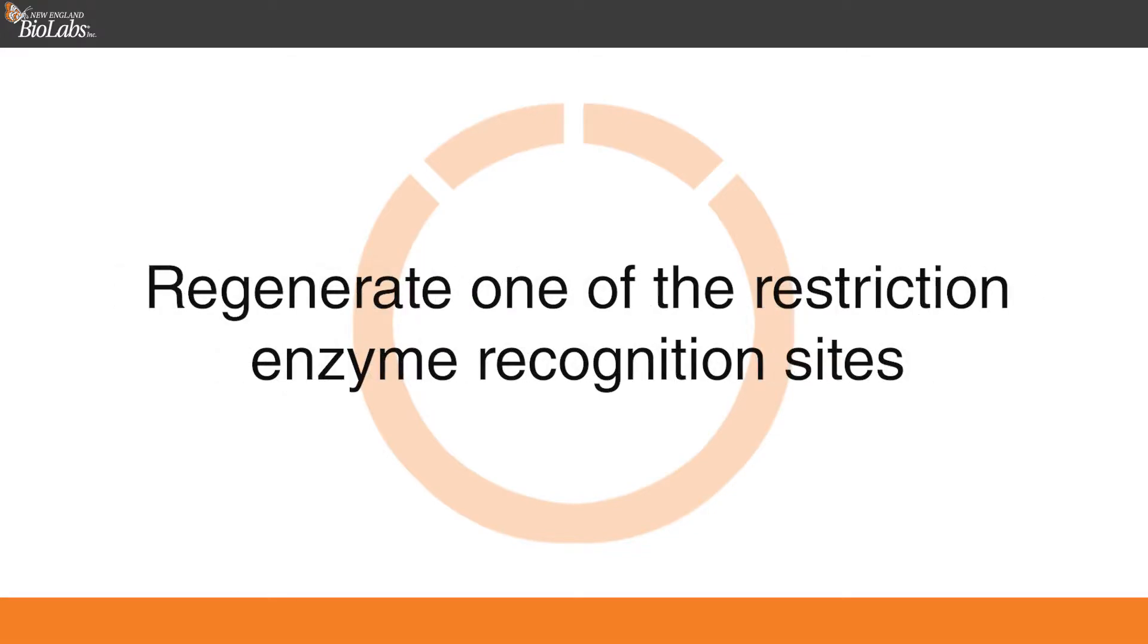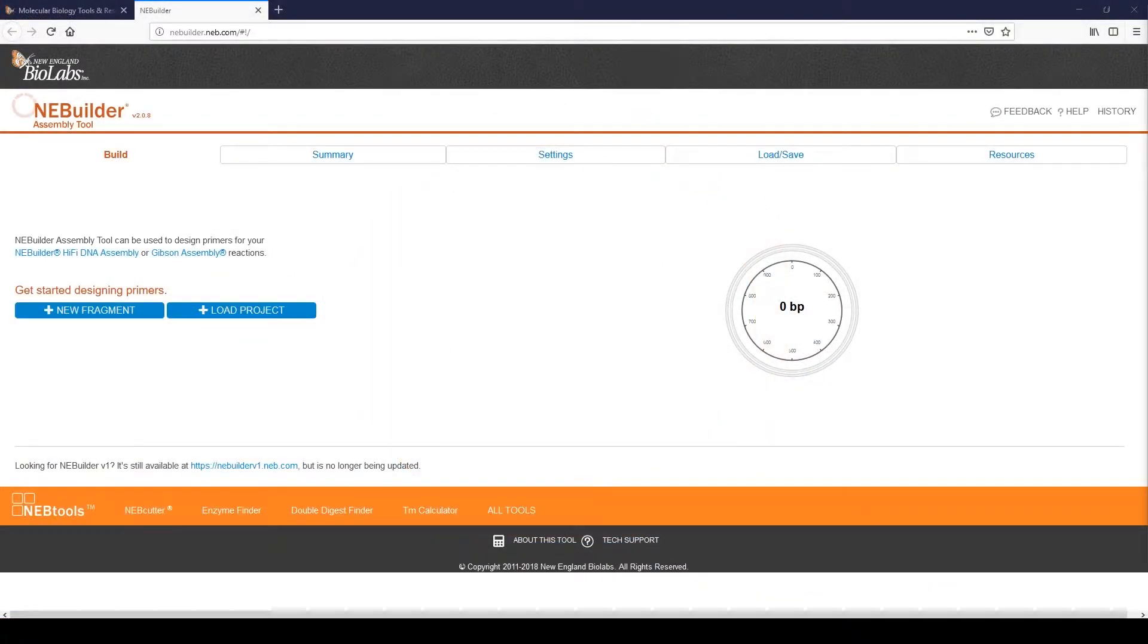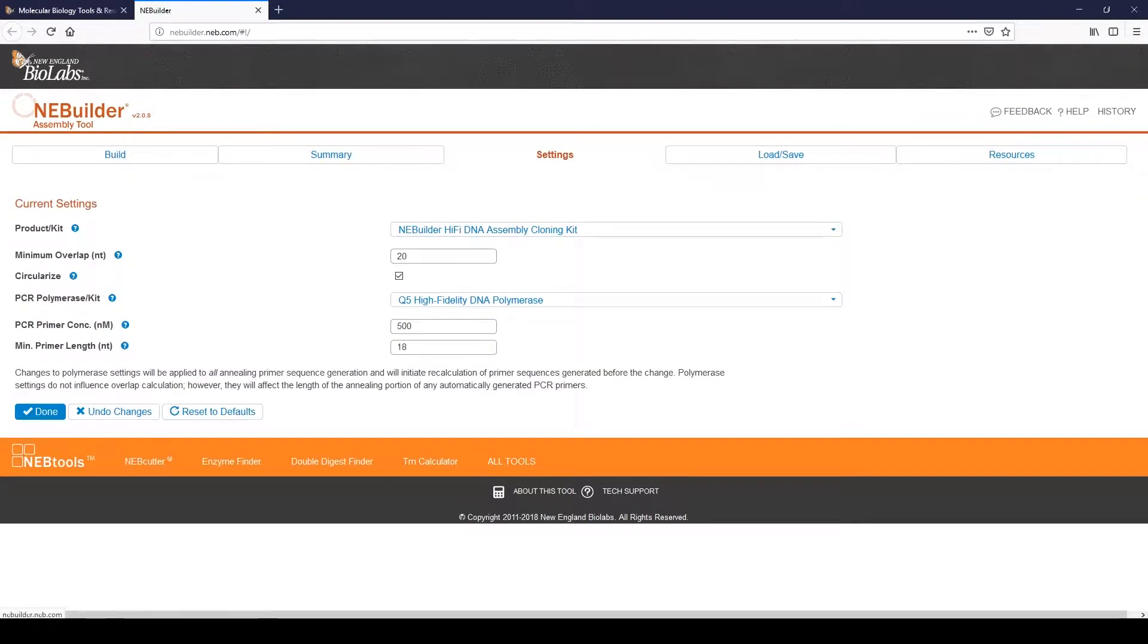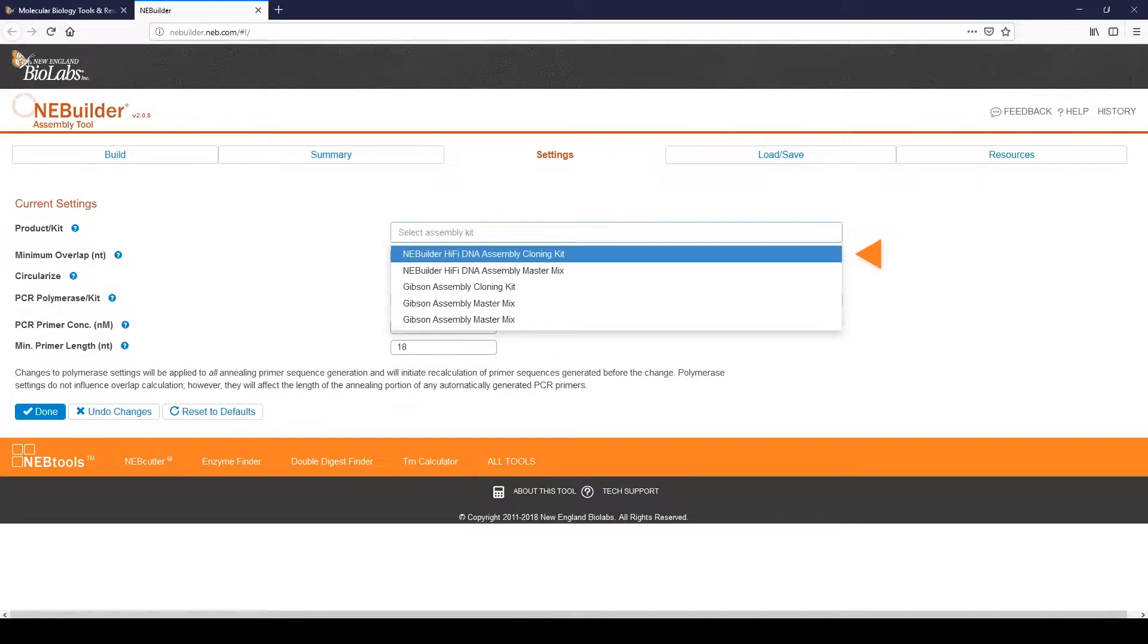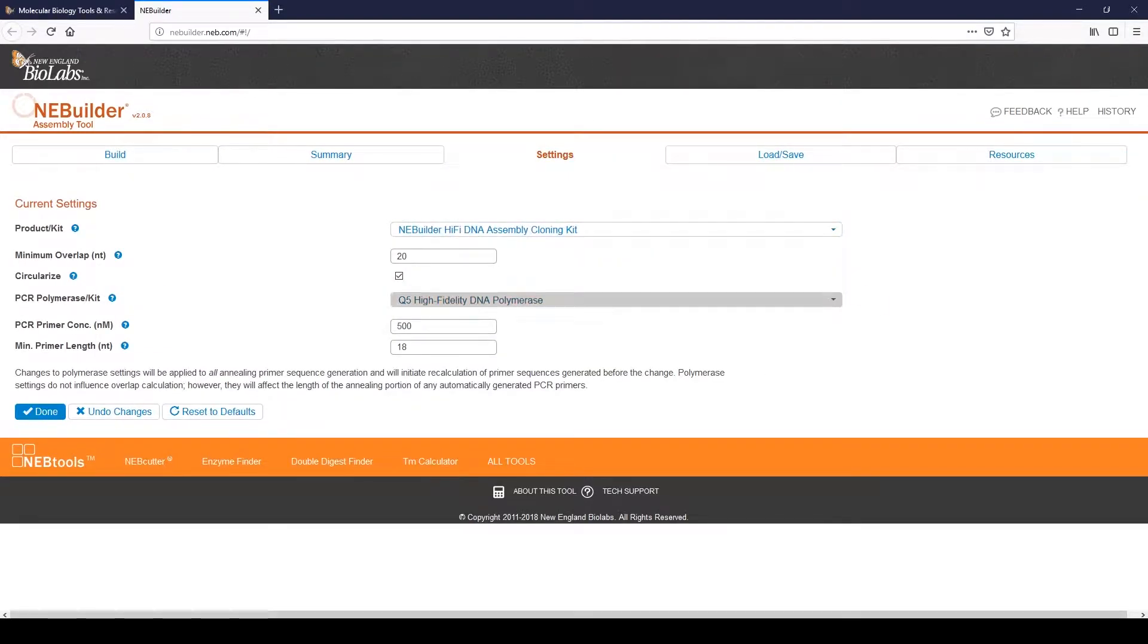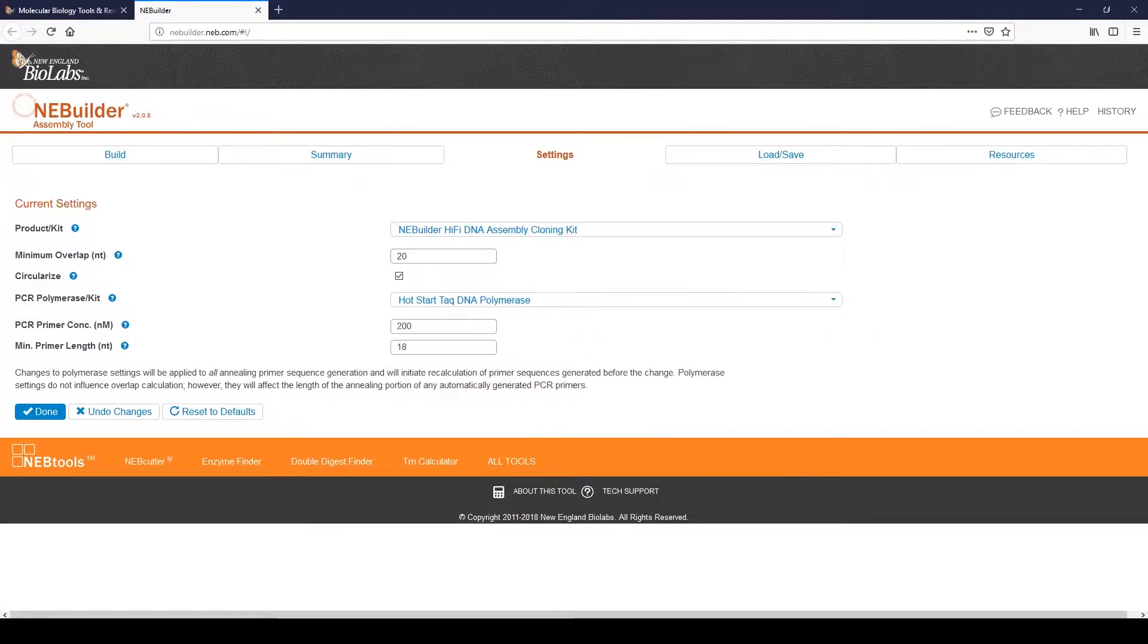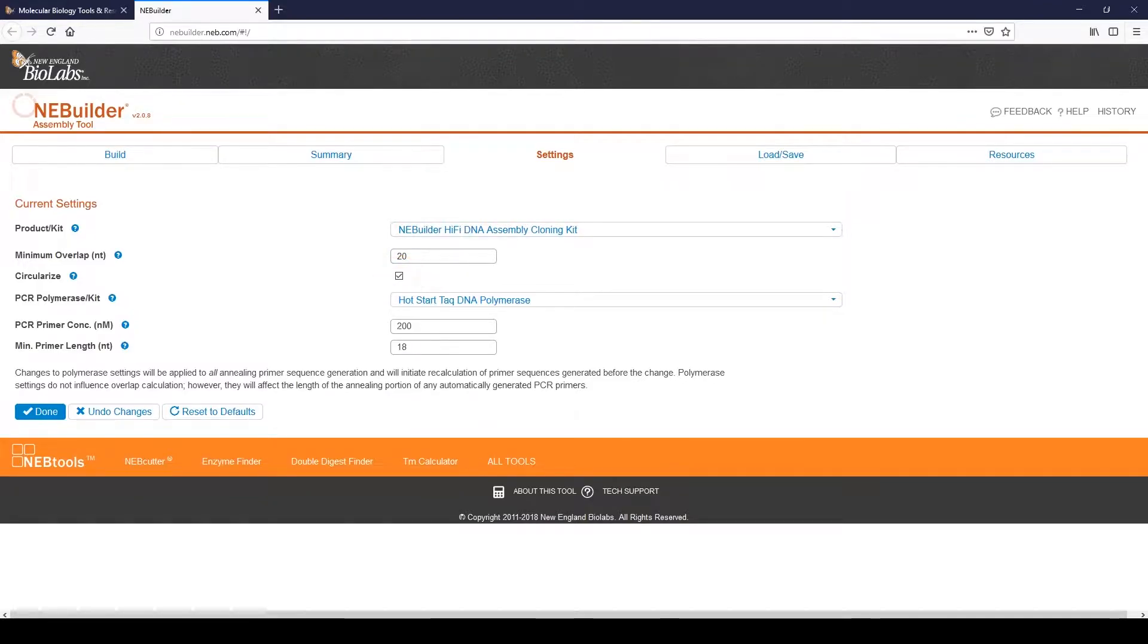We will also regenerate one of the restriction enzyme recognition sites. Begin by clicking on the Settings tab. Choose the assembly product and the PCR polymerase. The assembly can be linear or circular. We will be making a circular assembly product. Click Done.